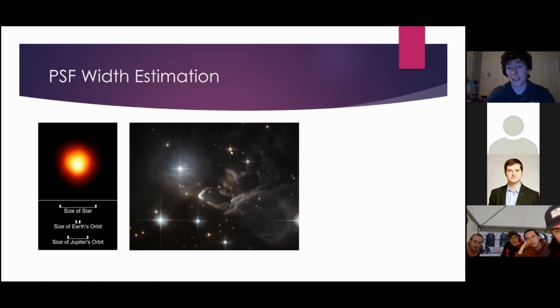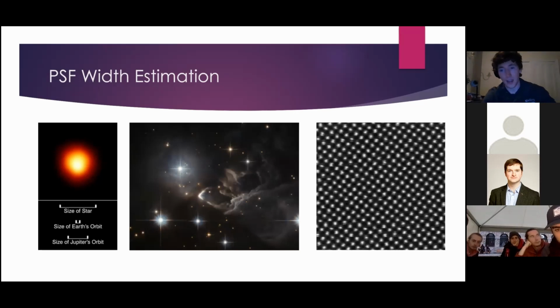the imperfections in the optical system, and the fact that you can't have a perfect optical system. That's where this is coming from, and it's exactly the same for atoms in the image. The deflection which gives us our signal comes from electrostatic interactions between the nucleus and the electron. But you know from analogies that you've probably heard through school that the nucleus is like a ball at the center of a stadium and the electrons are like dust in the stands. If that's the case, then why is there an impression that the gaps between them are comparable to the size of the nuclei themselves? It's just not the case. What's happening here is this is the best that the optical system can deliver us.